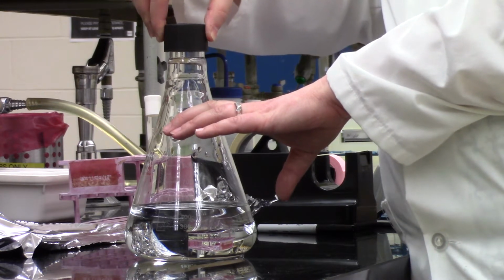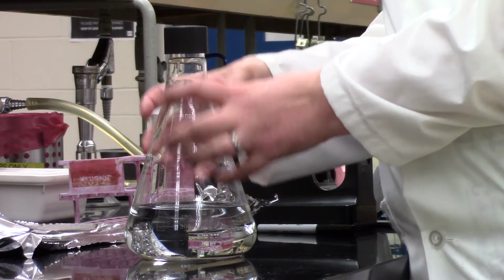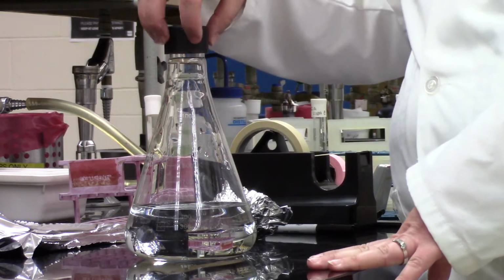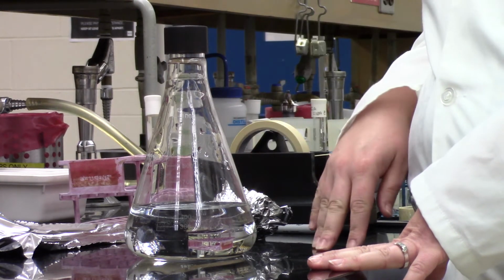So this means that pressurized air and steam can escape. That's not going to stay inside your flask and cause it to explode, but it's still covered well enough that any of your liquids are going to stay in and not damage the autoclave.